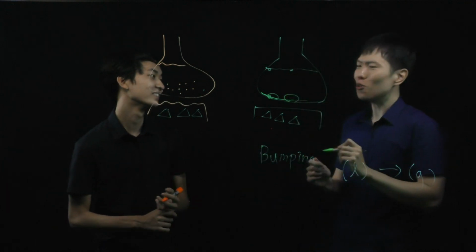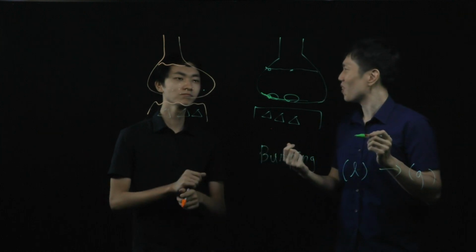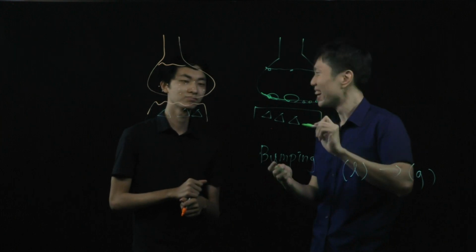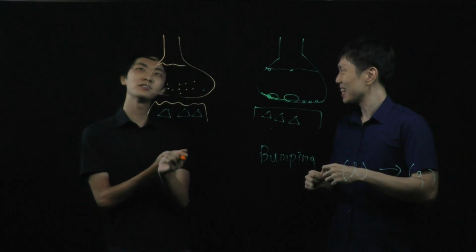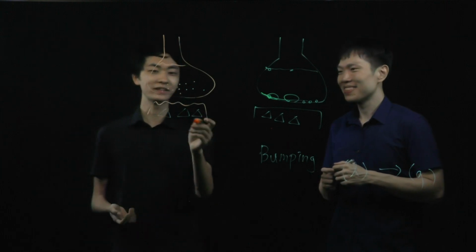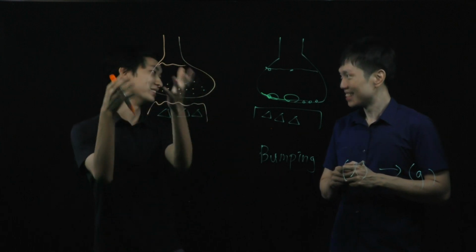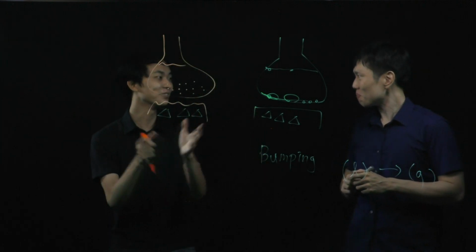But a question for you: why do they become big bubbles and then rise? Why are they not just small bubbles? Well, that's a good question. From what I learned, it has to do with superheating. If there are a lot of small places for the bubbles to form, the moment it hits the boiling point, bubbles form. But here, when it hits boiling point, there's nothing for the bubble to form. There are no nucleation sites.